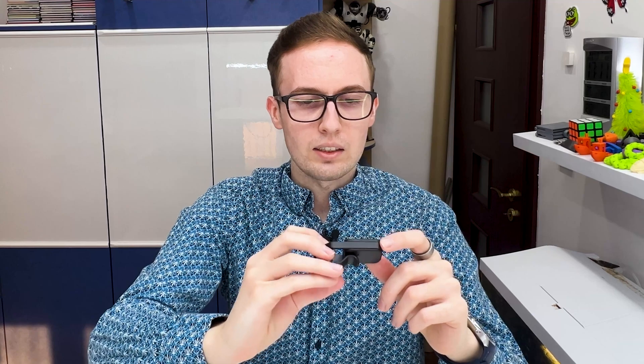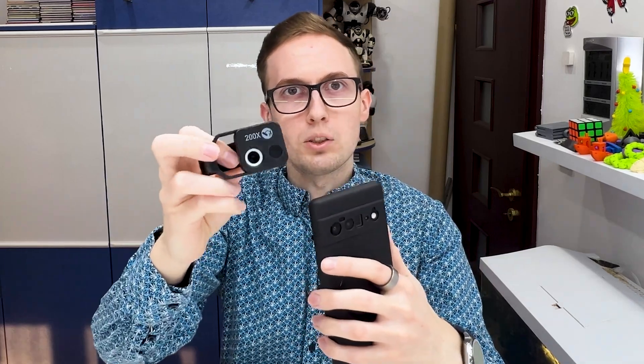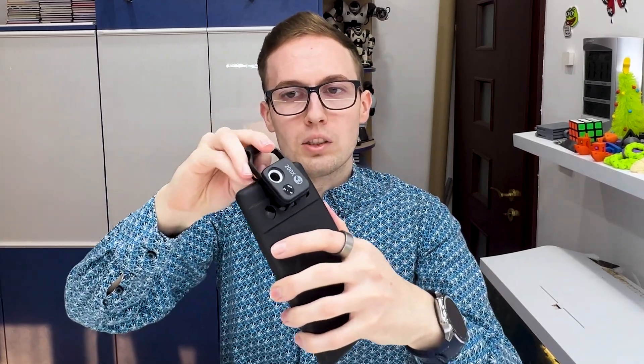They say it can zoom 200 times. I'm not sure if it is that much but it can zoom a lot and I will show you how much. We mount it on the smartphone using this clip and the mounting system is really good. I was positively surprised about this mounting system.